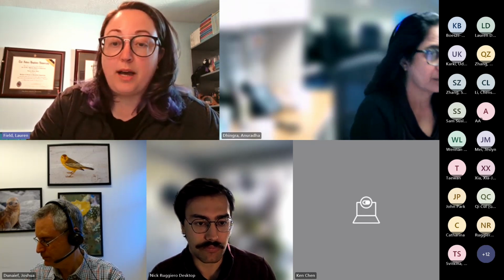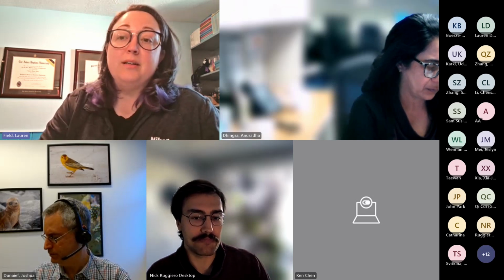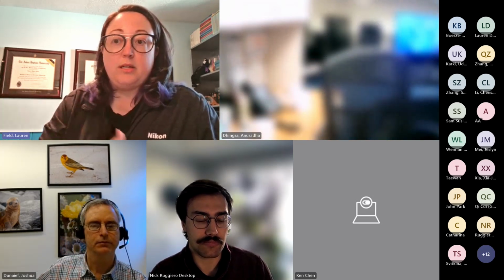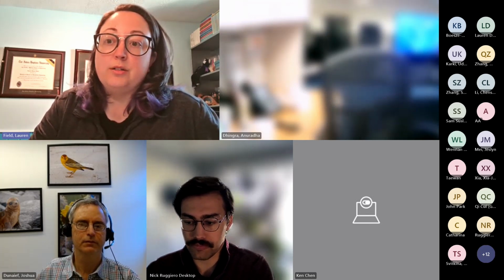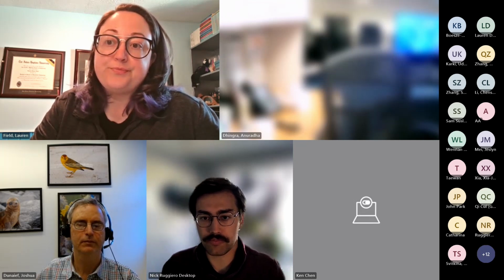I personally highly recommend that you report every single thing you do to every journal article that you're putting in. One of the nice things about these GA3 recipes, and Nick will show you how to do this in the software, you can save them out and submit them when you're doing a paper submission and say, this is exactly the recipe that we used on these images, just to give a more structured analysis flow for whatever paper that you're submitting to.